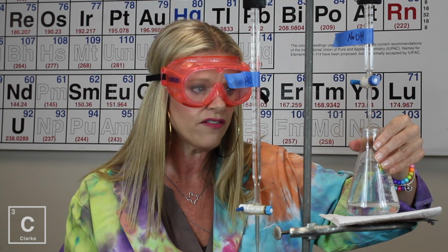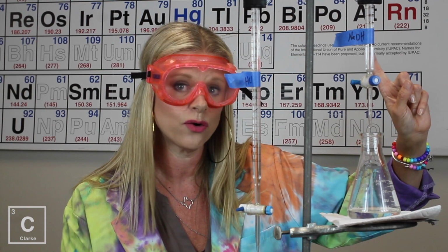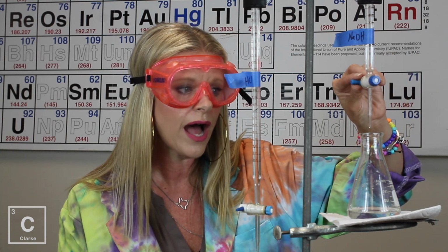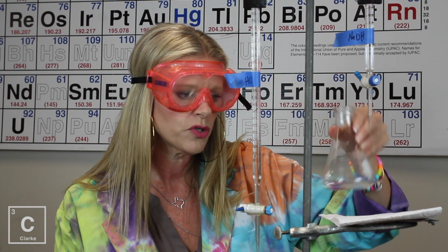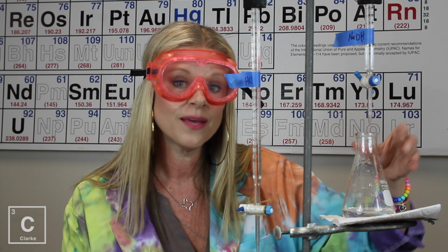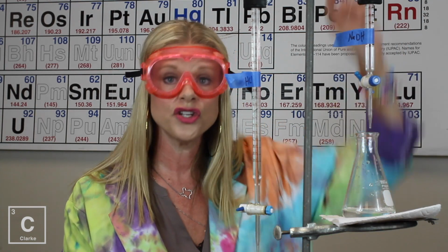So we still have a higher concentration of hydrogen ions here. This is still more acidic than basic. And remember, I'm trying to take it right up to that neutral. So I am going to add just the tiniest bit more base. I'm going to swirl. And you know something that I forgot to add? I took note of how much base I had, so then when I'm finished, I can subtract the numbers and know exactly the volume of base that I used.